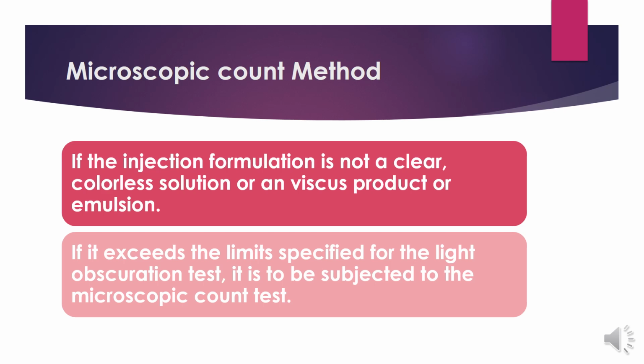So these are both conditions in which the microscopic count method is preferred by the United States Pharmacopoeia for clarity or particulate evaluation in parenteral preparations.